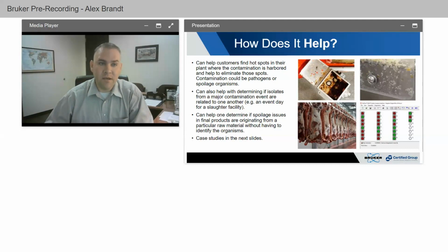I get called out quite a bit to come help customers with these issues. They may say, hey, I've got contamination problems, and maybe we've used some sort of subtyping technology like the Bruker to help narrow it down and say, these are the places to look at. Then I'll go into their facility and try to dig into their equipment, their drains and walls and all kinds of structural parts of the plant, and find out where this is coming from. And if we can identify it, then they can fix it and clean it and rectify it and make sure that it doesn't come back.